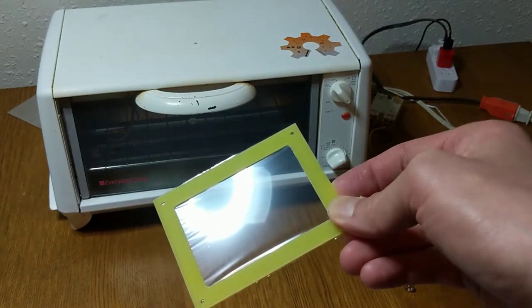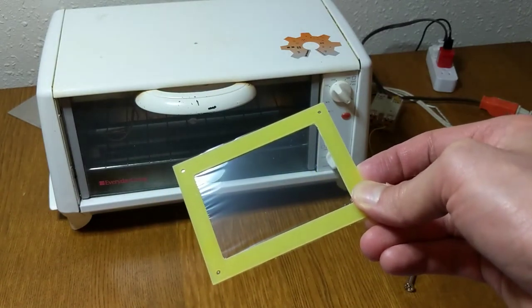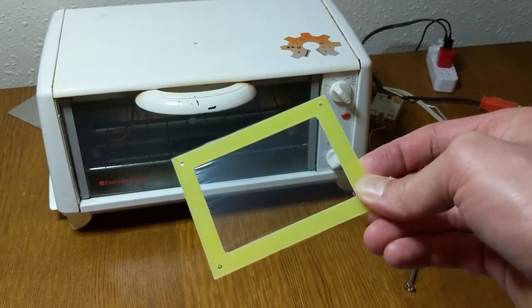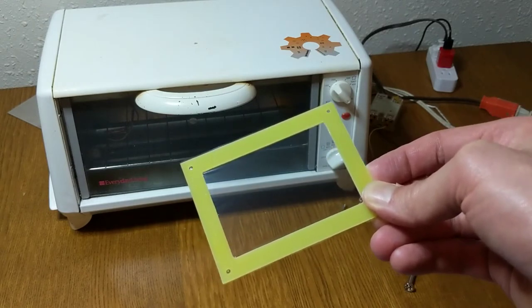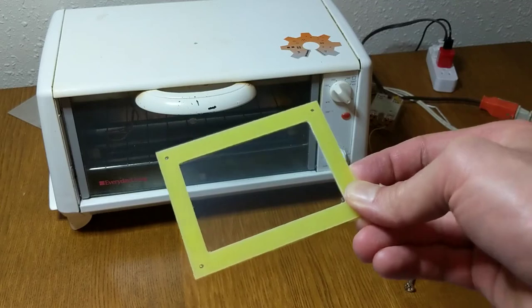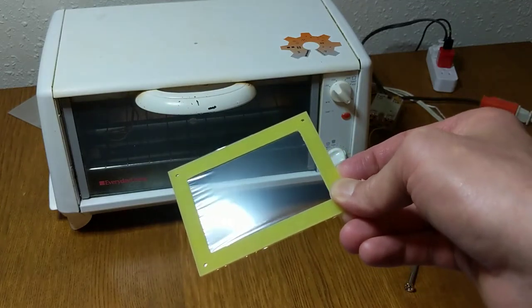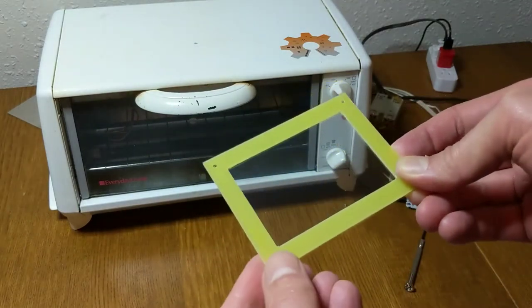You can see this mylar has a few ripples in it, it's not quite perfect. We're gonna put it in the oven here and when it comes out it should be looking much better. The oven is preheated to 120 C and we're gonna put it in for about five minutes.